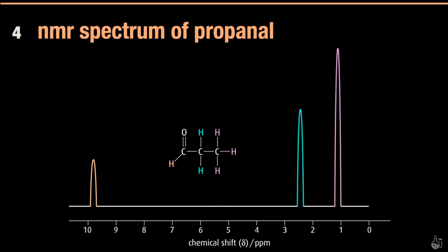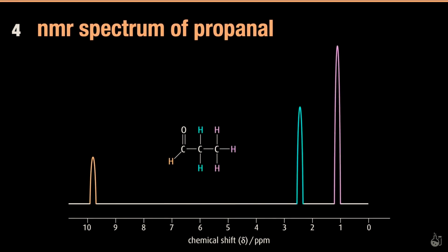So this is the end result first. This is what we're going to aim for. We should be able to look at a graph like this and come up with a structure like this. So we'll understand molecular structures and graphs together, so that when we see the graph later on, we'll be able to draw the structure. Now, what you will see are things called peaks. And I'm also talking about the stuff written in the next 2-3 slides because it's all together.